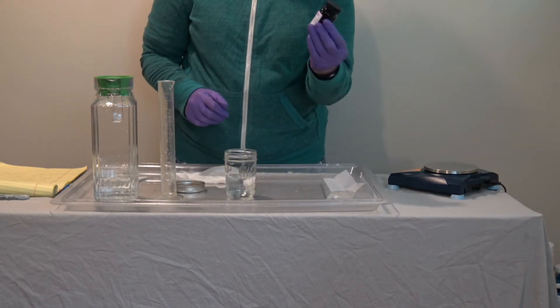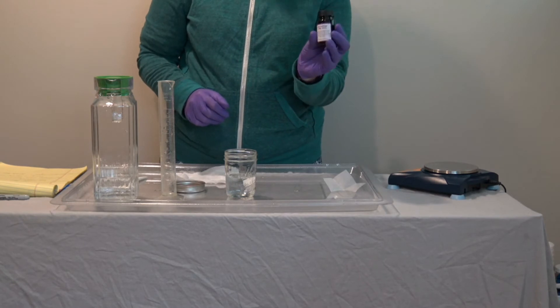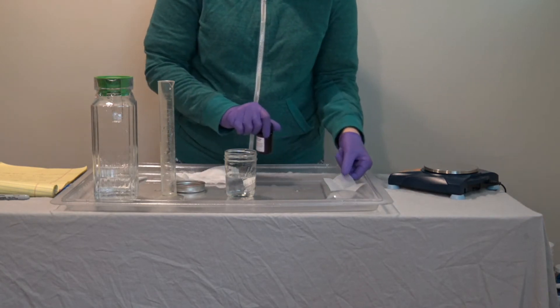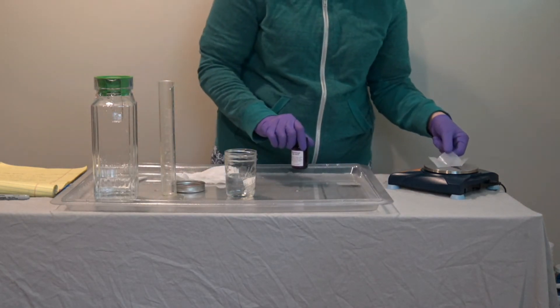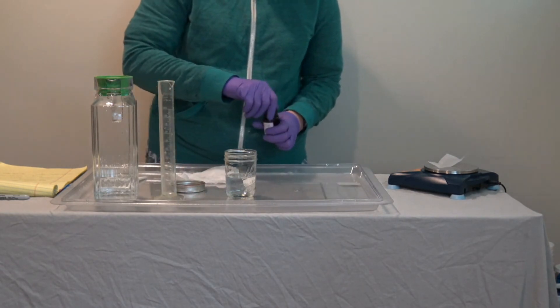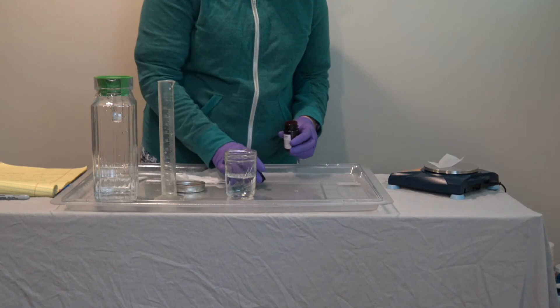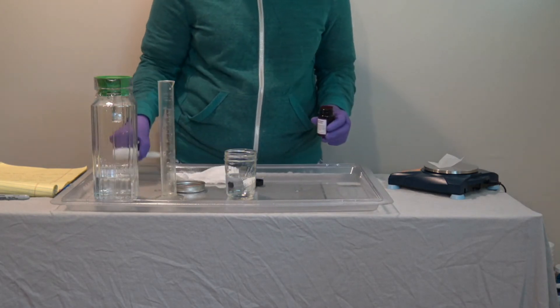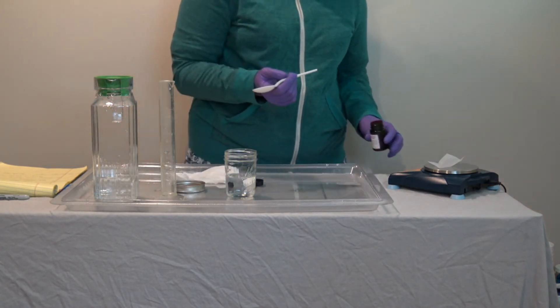And then you will have a dried powdered red cabbage juice that we will weigh out. So I'm going to put a piece of parchment paper on my scale and tare it. And we are weighing out 0.1 grams of this.